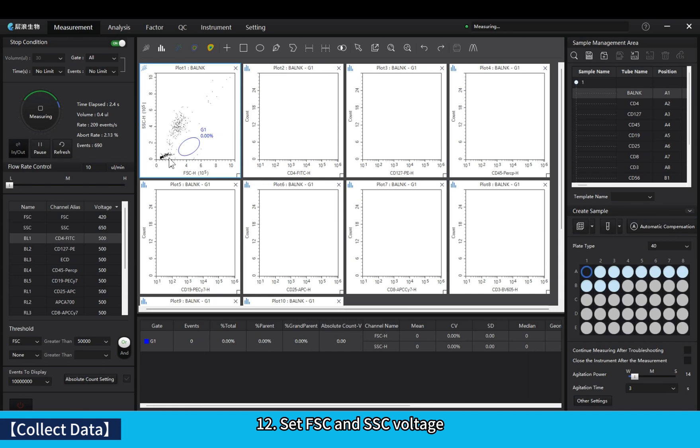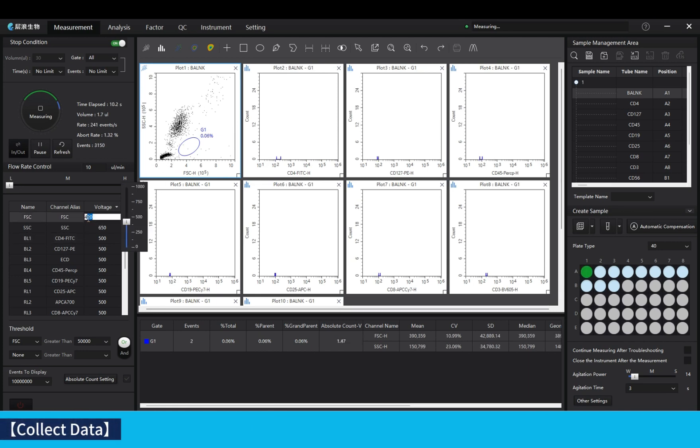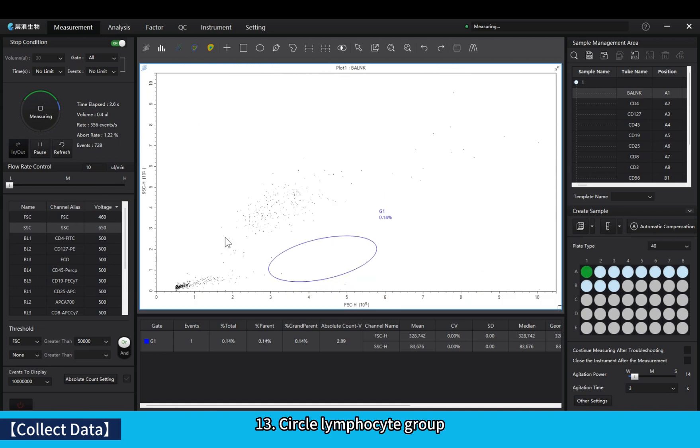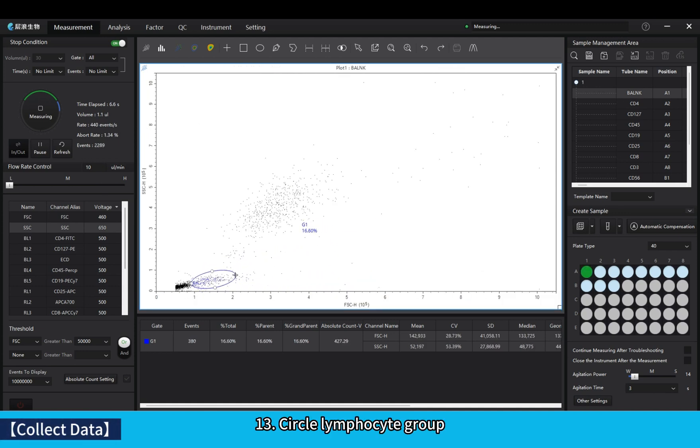Set FSC and SSC voltage. Circle lymphocyte group.